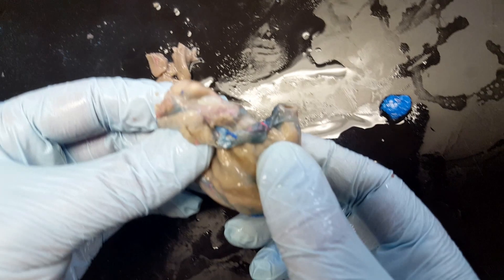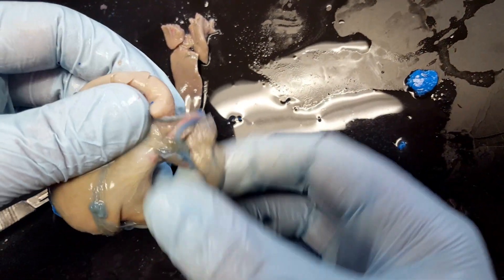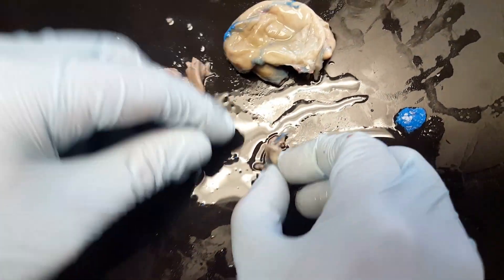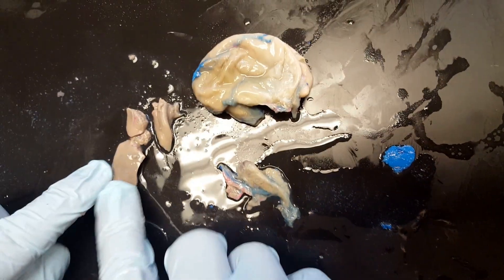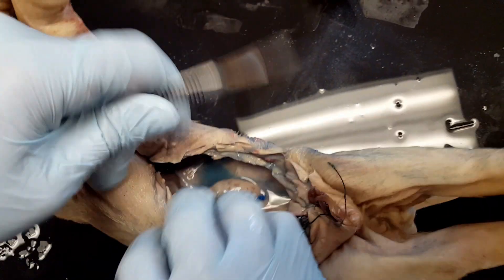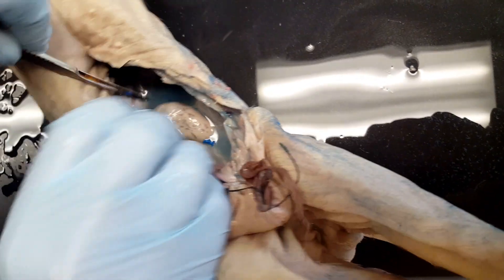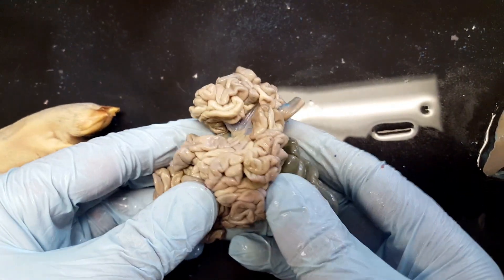Here's our stomach and attached to it is going to be our spleen. Go ahead and cut the spleen — I just ripped it off from the stomach, so I've put it into three pieces, but here is the spleen. And here's the stomach. We can see part of the pancreas attached to the stomach, so I'll go ahead and detach that. We've got some pancreas, stomach, and spleen. I'm going to go ahead and cut out the intestines, cutting right around the beginning of the rectum.